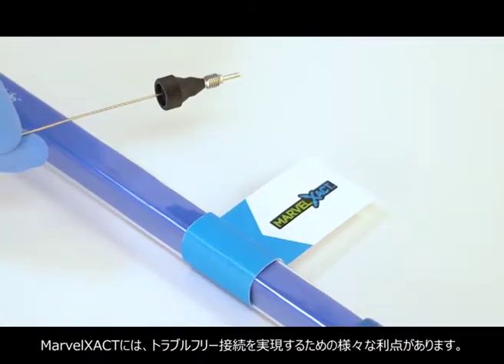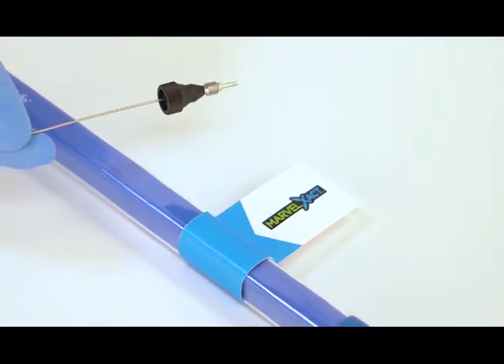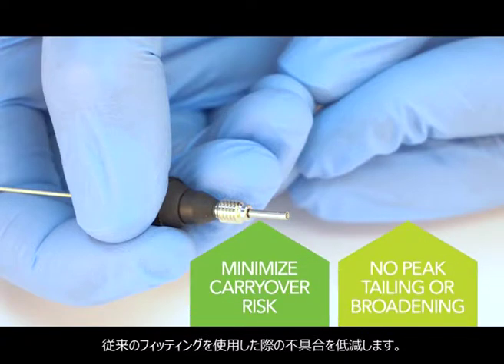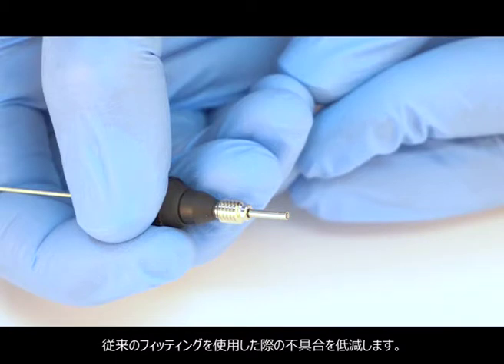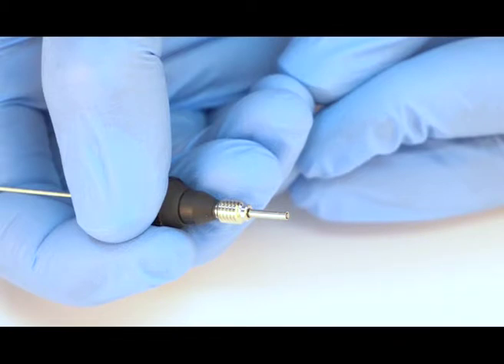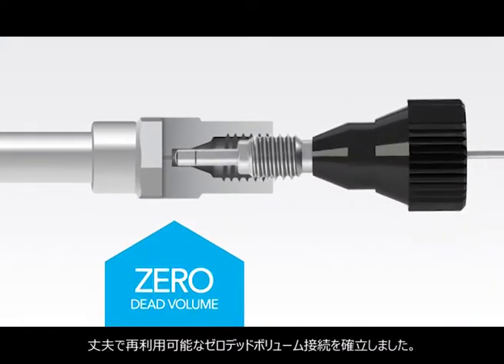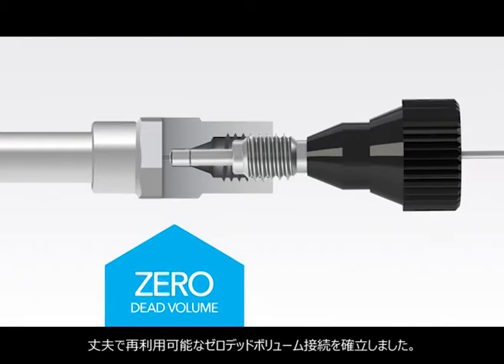Marvel Exact has several key benefits making chromatography connections trouble-free every time. Foremost, it incorporates our advanced Marvel X sealing technology to deliver precise face sealing at the port bottom. This minimizes the risk of poor chromatography results that users often experience with conventional fittings. Marvel Exact uses an enhanced proprietary tip design that seals at the port bottom to ensure a robust and repeatable zero dead volume connection.